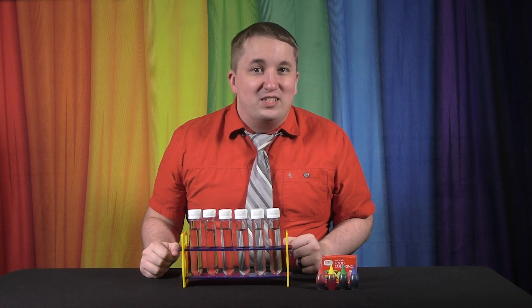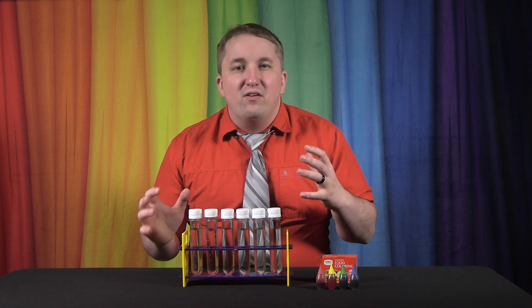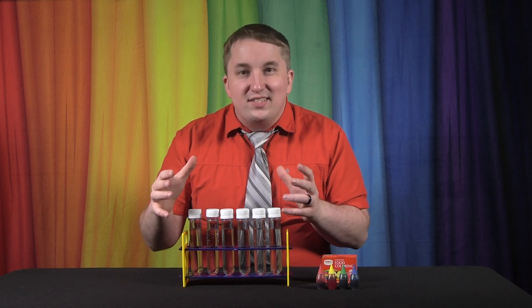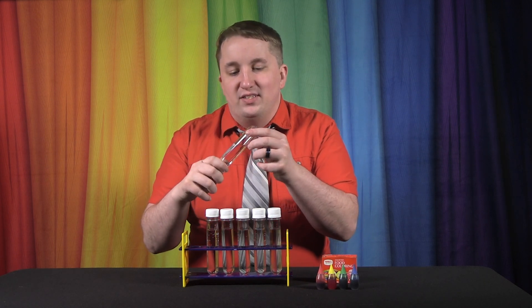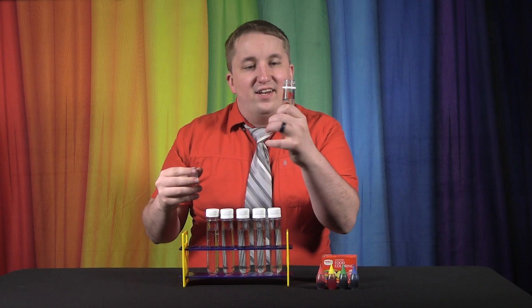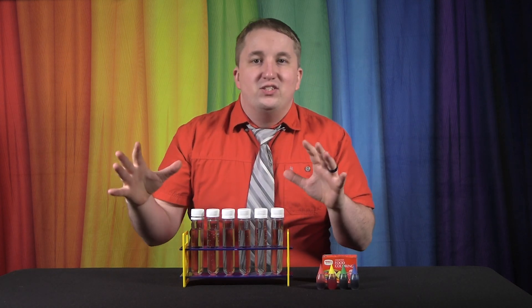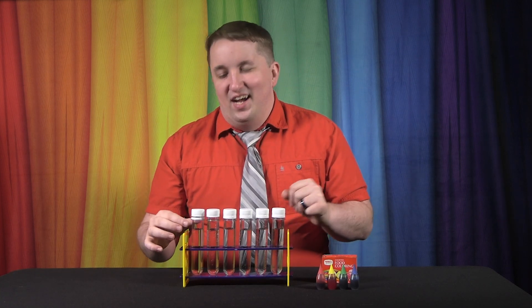All we need for this experiment is some test tubes with water in them. This kit is from Amazon — it was about 15 US dollars, fairly inexpensive, and you can get it for your home or school. This kit is made with recycled plastic, so you don't have to worry about the environment. It has little test tubes with caps that just screw on easily, and it comes with directions for different experiments you can do besides this.